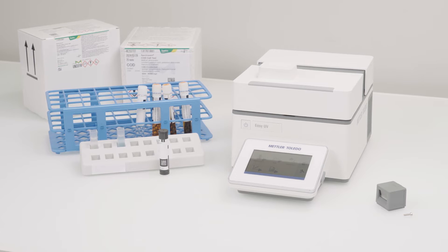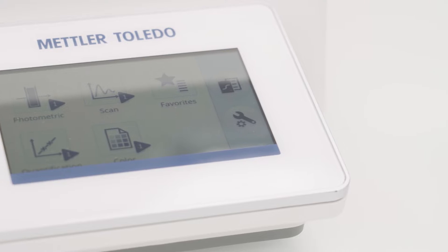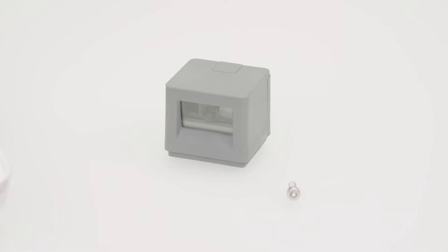Mettler Toledo's EasyPlus UV-Vis Spectrophotometers support SpectroQuant test kits. But there is no button on the screen? You can order separately the SQ-Kit reader from Mettler Toledo. In this video, you will learn how to connect it easily.